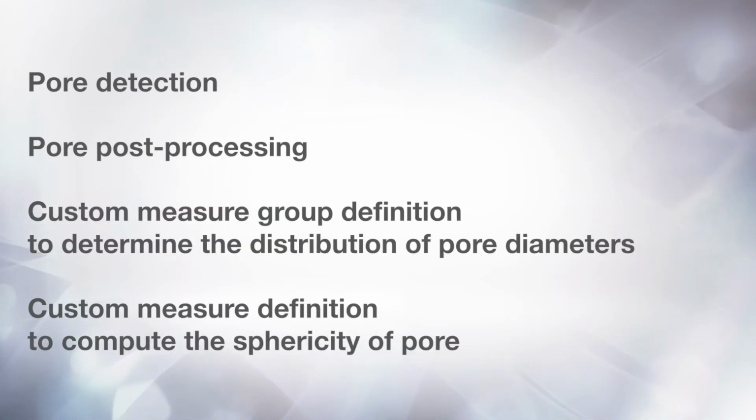This section is divided into the following 4 steps: pore detection, pore post-processing, custom measure group definition to determine the distribution of pore diameters, and custom measure definition to compute the sphericity of pores.